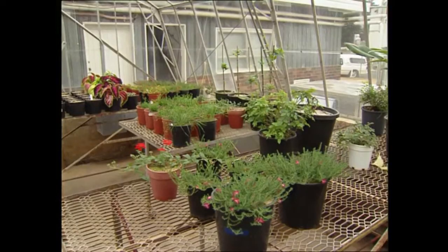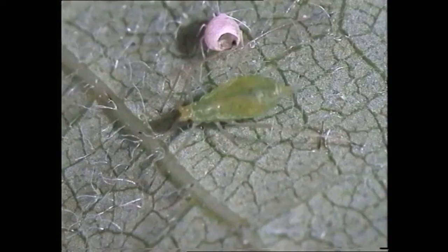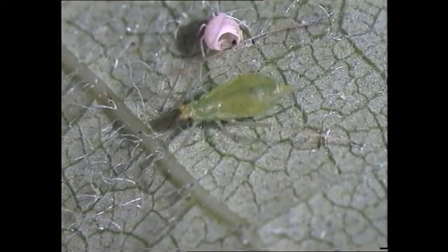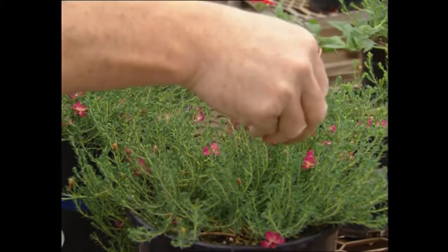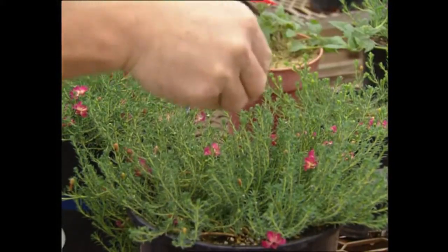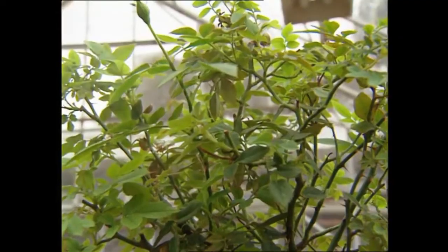Growing plants in a glasshouse will not only reduce the population of microorganisms which are living on the surface of the plant, it also helps to produce quality plants for stage 1 due to regular fertilization, use of fungicide and insecticide.